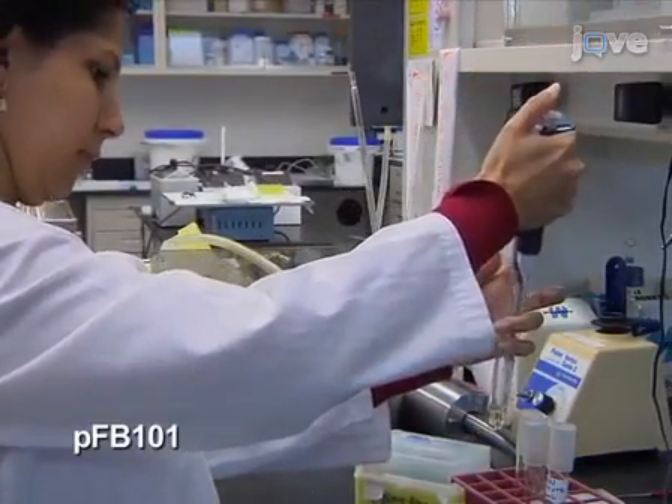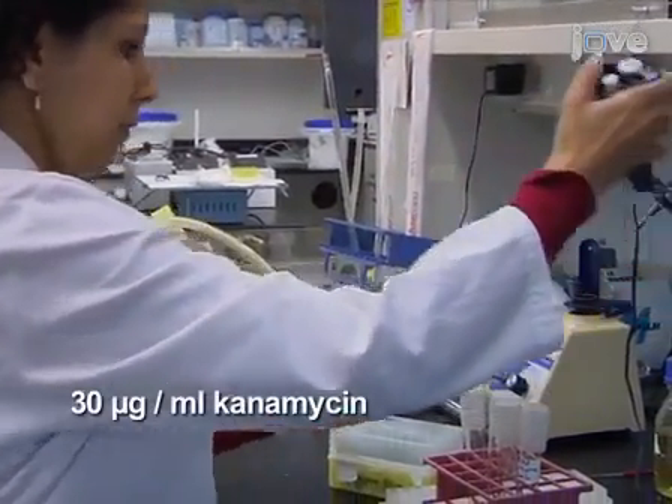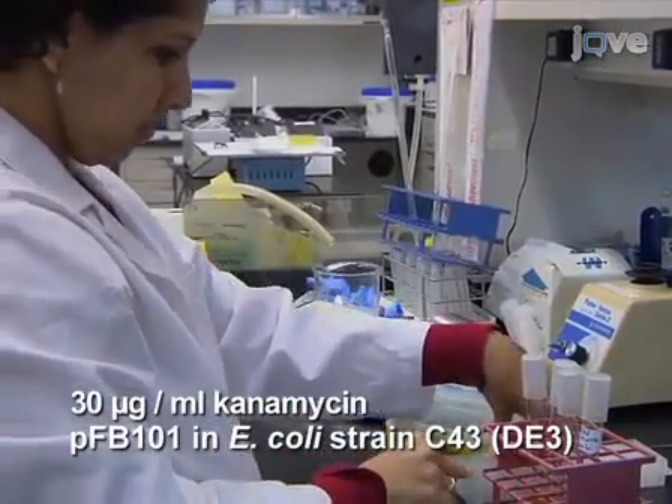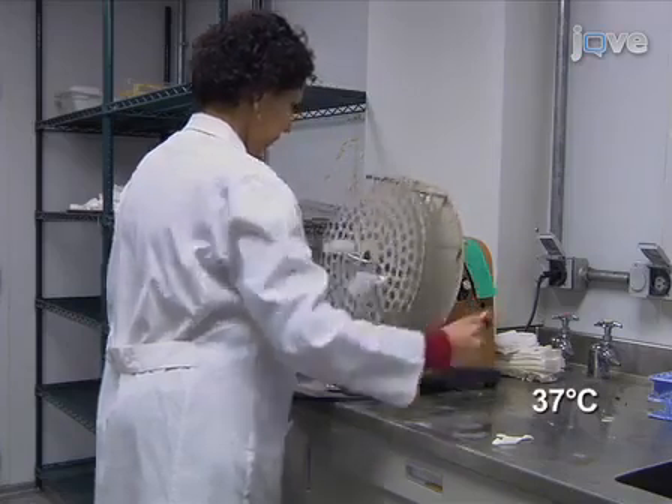Start in the evening by inoculating four 3ml LB kanamycin cultures with fresh transformants, or use a frozen stock. Grow the cultures on a roller at 37 degrees Celsius overnight.